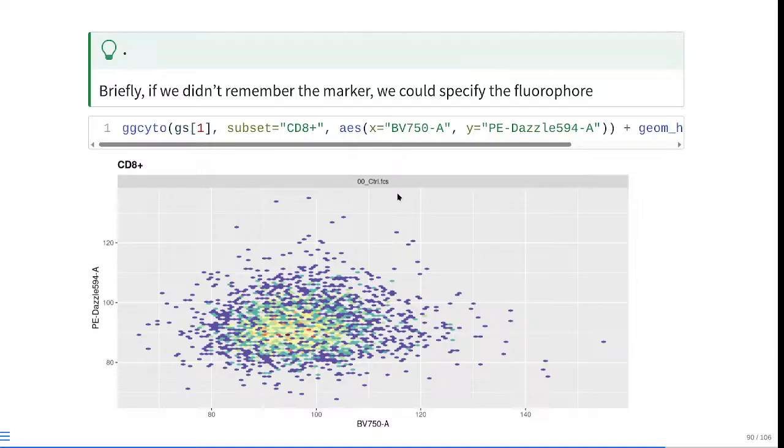And just remember, this is just the very base layer of the plot. We can do a lot more customizations, and we will over the next couple weeks. So if you don't like the gray background, if you don't like the label being on the far left side and want to move it to the center, these are all things that, using the grammar of graphics, we're going to be able to customize and edit as we go. Then if we don't want it as zoomed in on the population and want more of the scaling appearance we associate with FlowJo or FCS Express, we're able to do so as well.